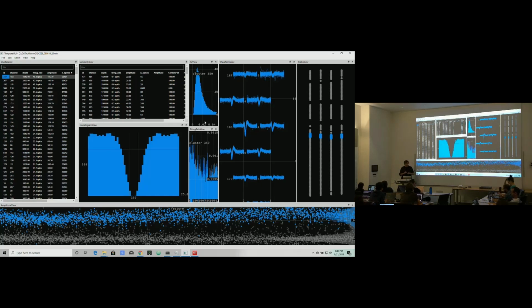Unless you've got things that are more bursty. So maybe a neuron can't fire 1 millisecond after it just fired, but it might be bursty and fire every 10 milliseconds or so. They will result in a particular structure in the correlogram view that you'll learn to recognize easily.